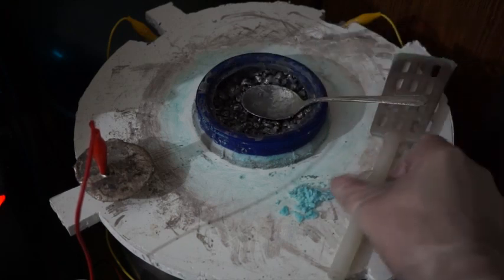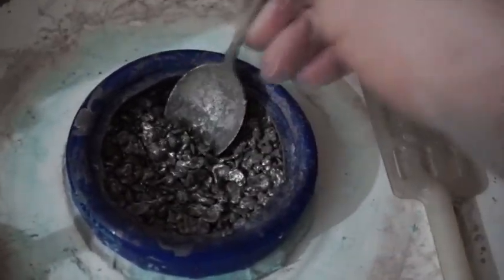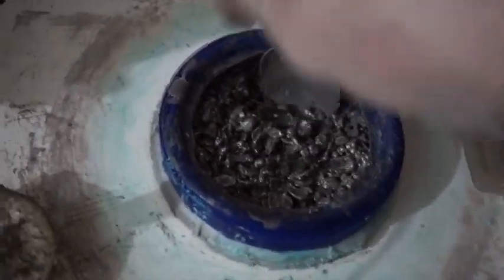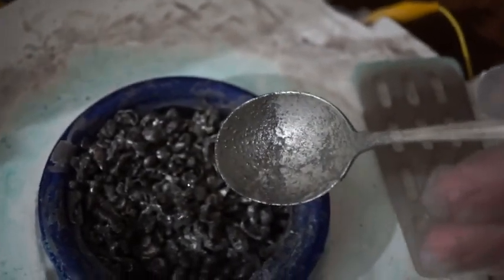Digging around in the anode basket with a spoon reveals that the silver shot has glued itself together with what I believe to be mostly cement silver, silver and copper nitrate crystals, and some platinum group metals.